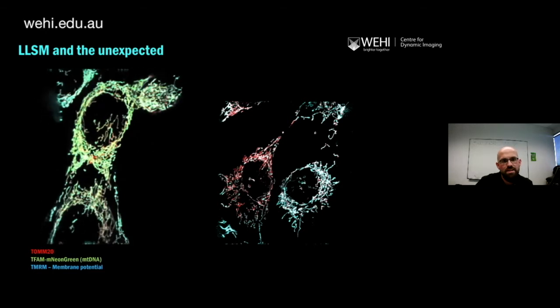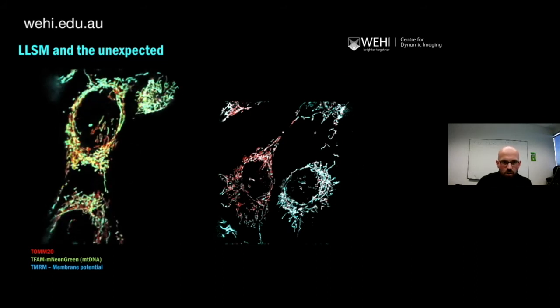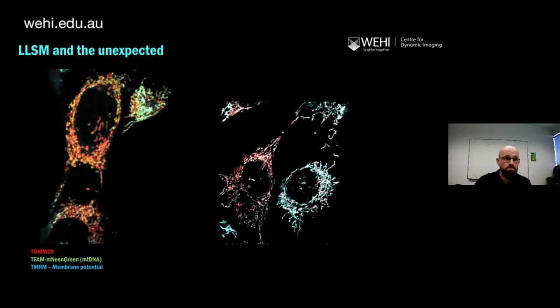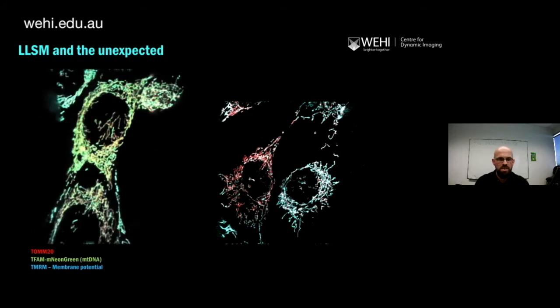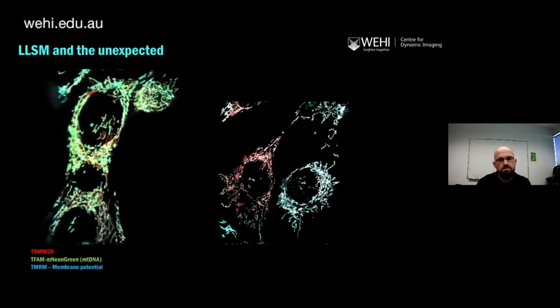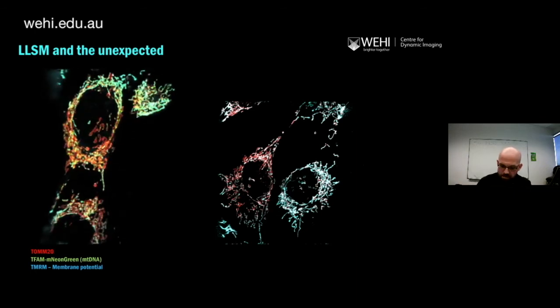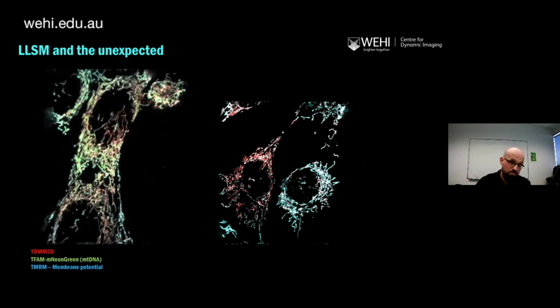You actually see it begins to blink at a single mitochondrial level. It sort of flashes on and off as the cell begins to die. Now, I don't know if this is particularly relevant. This is just an example of the blessing and the curse of this type of technology: you can start looking at one thing and start to see several others, and it can take you off on some really strange tangents, but it can be quite exciting.